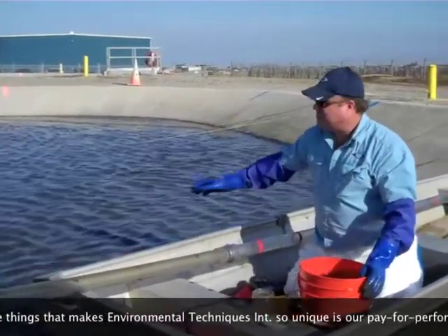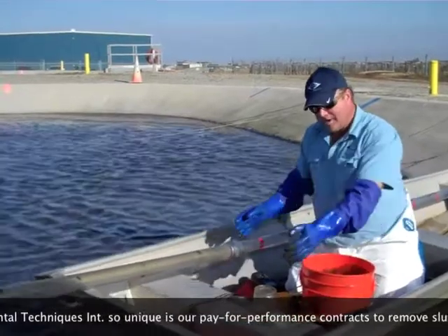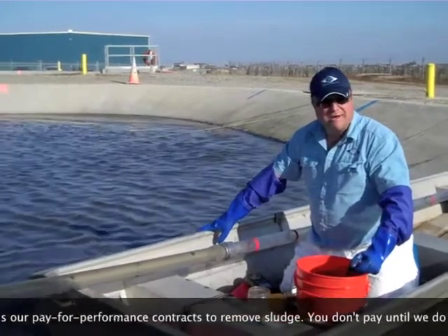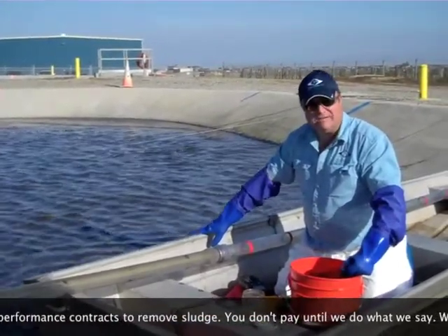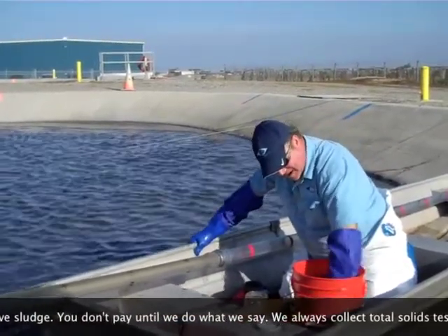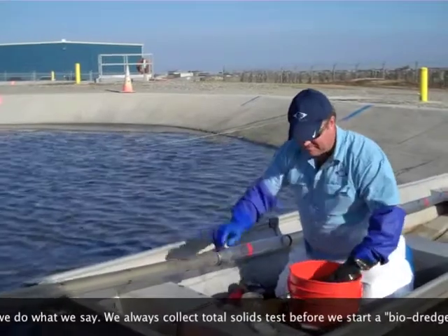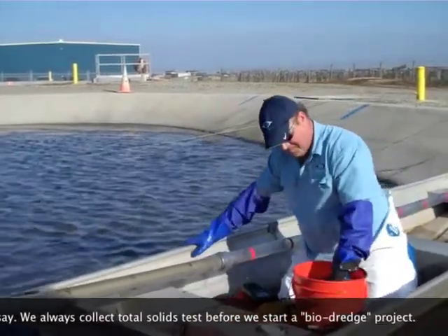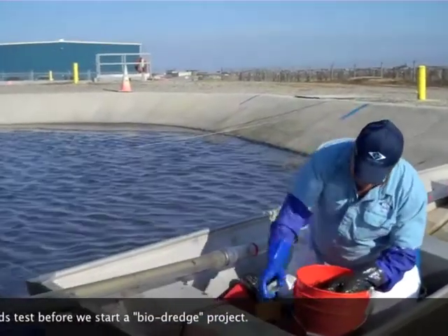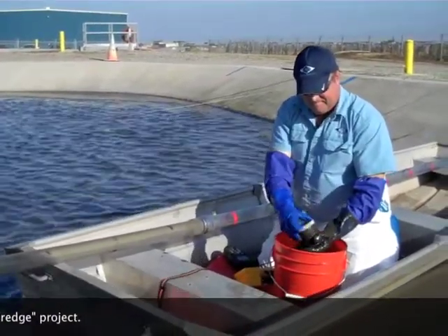This bucket is filled with a composite sample. I've taken six samples and put them into the bucket here. We're going to fill this jar and then send it to the lab and run a total and a volatile solids test — total solids in milligrams per liter and percent solids, as well as volatile solids. So I mixed it up real nice with my long logs. Nice sample there. Label my bottle.